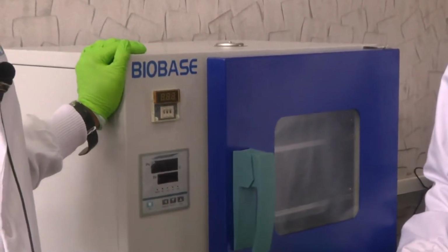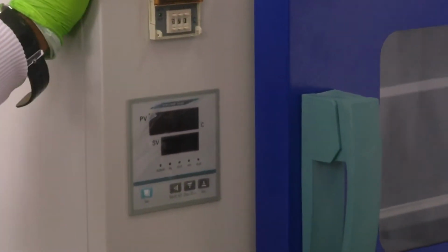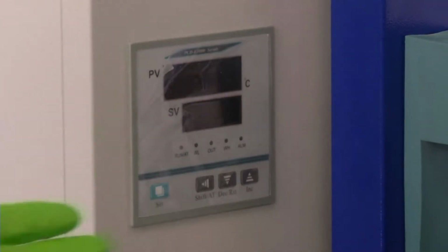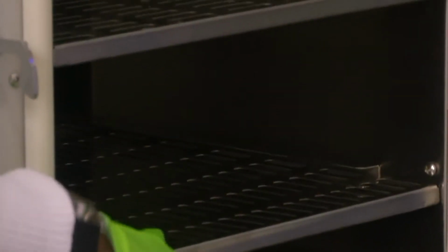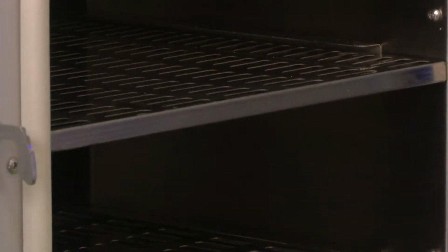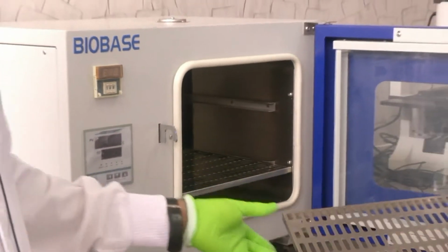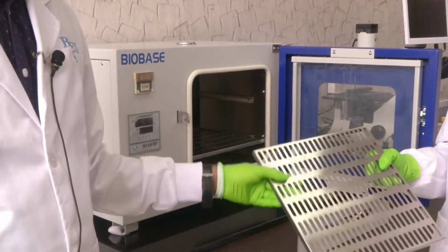Suman will show you, and I will explain, the different knobs that are available in this oven. To start off, we have not switched it on. Let us open the door and see the arrangement inside. As you can see, there are two trays where you can keep your samples. You can even take them out, because you need to maintain these trays in a very clean manner. Frequently you have to take them out and clean them properly.